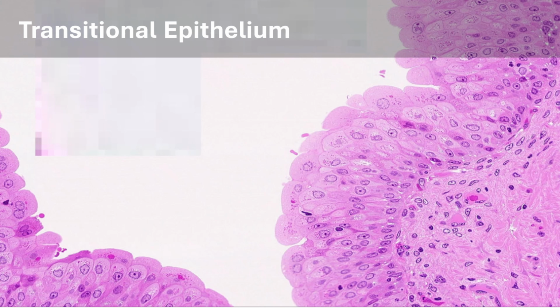Transitional epithelium is the final type of stratified epithelium that can appear on our practical. Transitional epithelium is found exclusively in the urinary tract in humans. It is composed of the same basic organization as other stratified epithelium, a somewhat cuboidal-shaped basal cell layer and an apical cell layer. The big difference in transitional epithelium is that the cells can change shape.